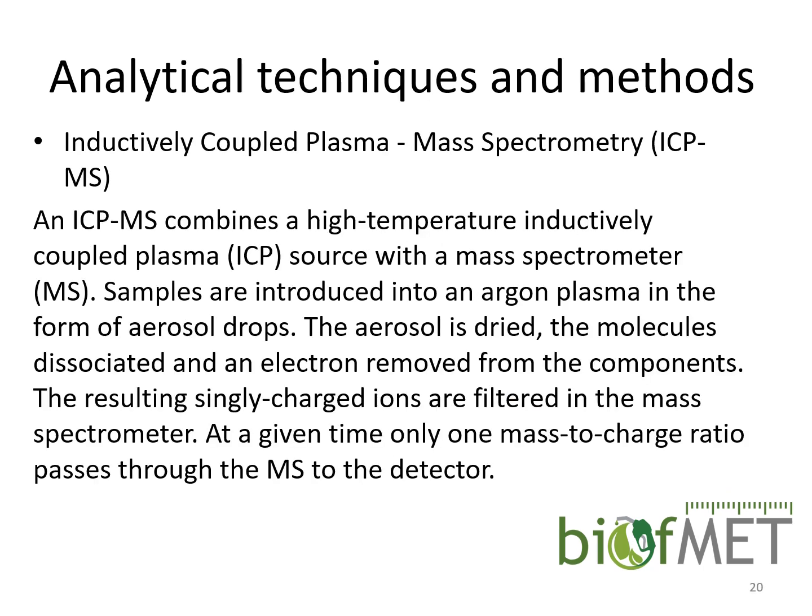When it comes to ICP-MS, it's also inductively coupled plasma, also made of argon, such as for ICP-OES. It's only that the detection system is somewhat different, so it is not an optical method, it is mass spectrometry. That means that you are not focused on determining the identity or the concentration by the emission spectra, but rather on the ions formed in plasma.